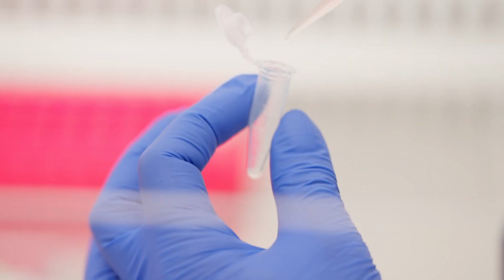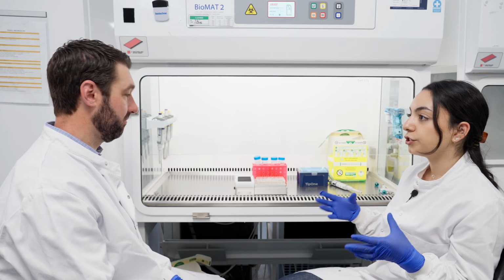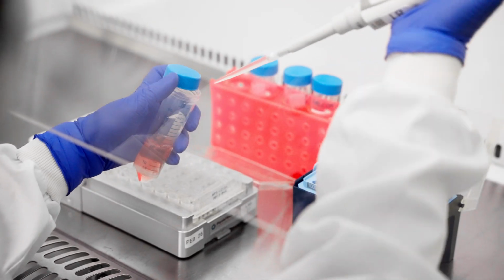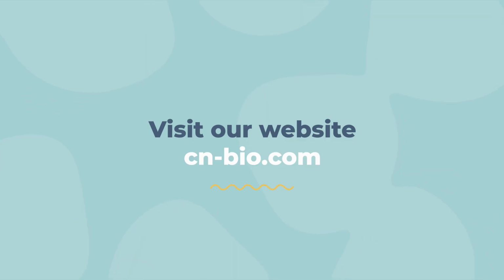And don't forget, at every media exchange, we have the opportunity to remove media for longitudinal analysis. This is also when we dose the tissues again if performing a repeat dosing study. And that's it. It's easier than you think.